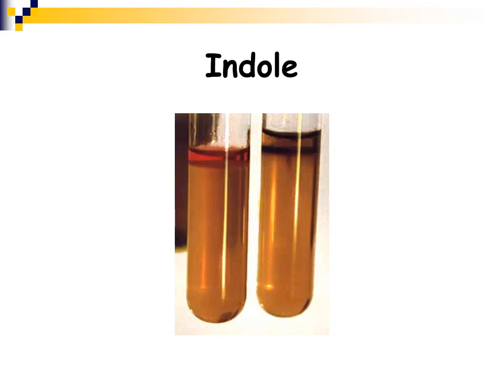So here you see you have your tryptone broth inoculated with your organism. You add your Ehrlich's or Kovacs reagent. On the right-hand side is a negative reaction. You just see the reagent on the top, which is kind of a greenish color. And on the left you have a positive reaction. You get a bright red color when you drop the reagent on the top.